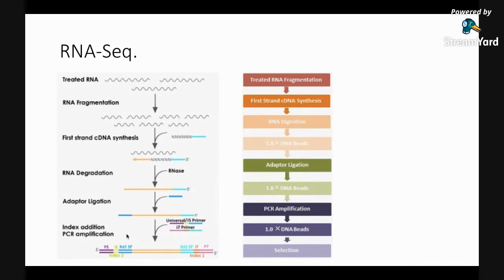So Illumina calls them I5 and I7. And these are the barcodes. These are unique for each sample. So depending upon the combination of I5 and I7, you will tag each sample separately, right? And that also means that in a single reaction, you cannot really reuse your I5 and I7.